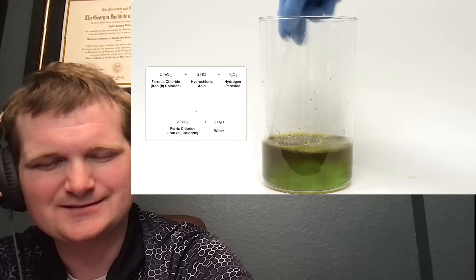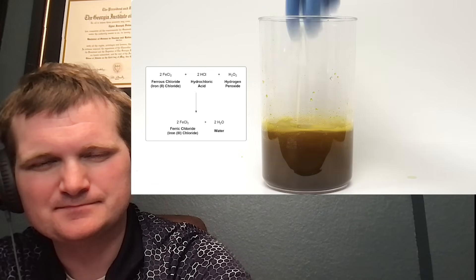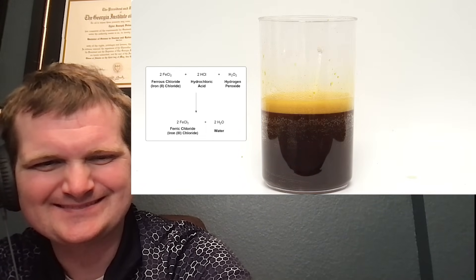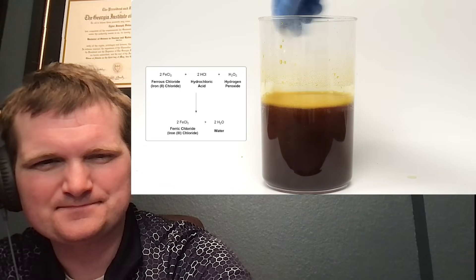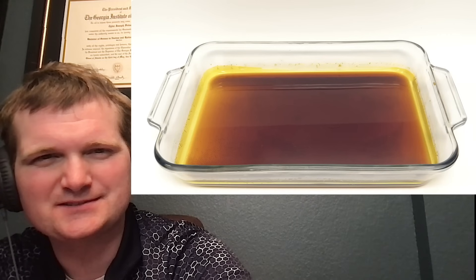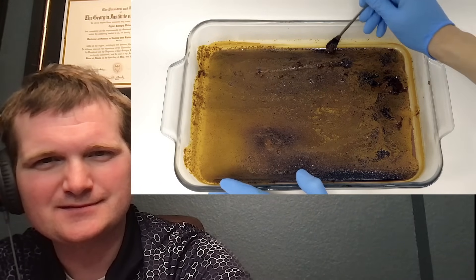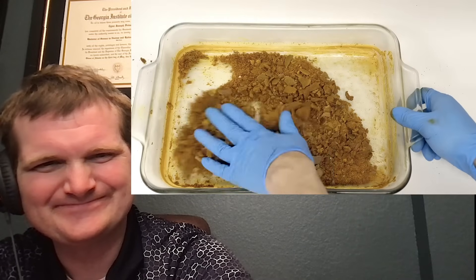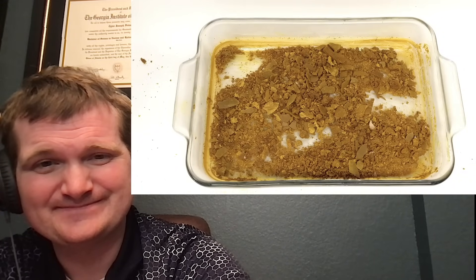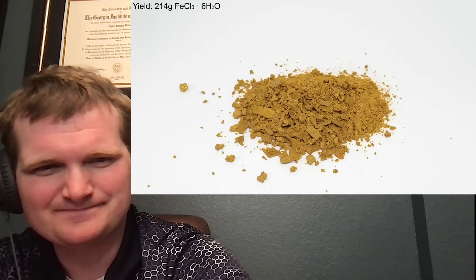This iron-2 chloride was then oxidized to iron-3 chloride using hydrogen peroxide. In theory it's also possible to oxidize it by just bubbling air through it, but that process is kind of slow, and this method is way faster. The moment it was added, a yellowy-brown color appeared, which was the iron-3 chloride. In total, I added 550 ml of the 3% peroxide, mixed it around thoroughly, and then poured it into a large dish. I set up a fan off-screen and let it evaporate for a couple days. Then I started scraping it off the dish, even though it was still a bit wet. In total, the entire drying process took about three days, but that's just because I let it air dry — I could've sped it up quite a bit if I put it in my oven. The final yield was 214 grams of iron-3 chloride hexahydrate, meaning that every iron-3 chloride molecule has six water molecules associated with it.